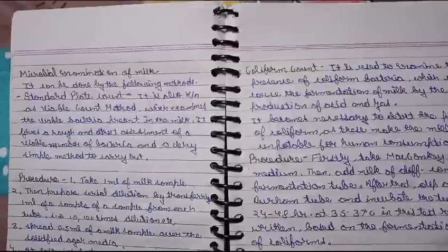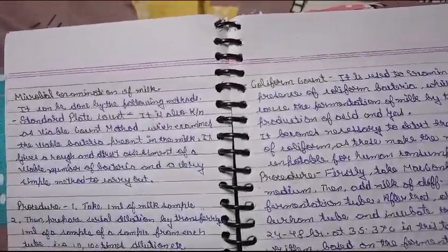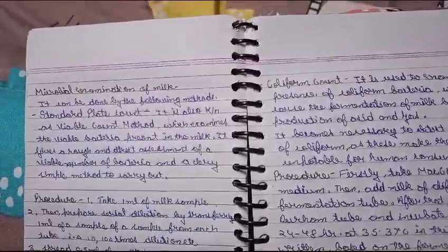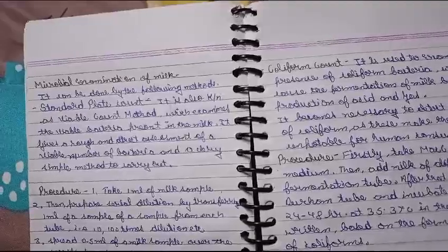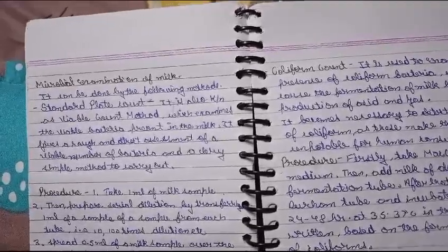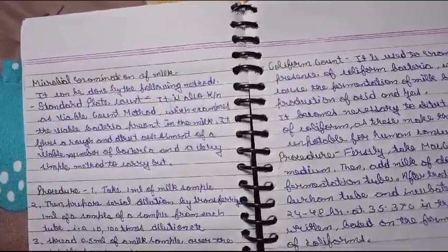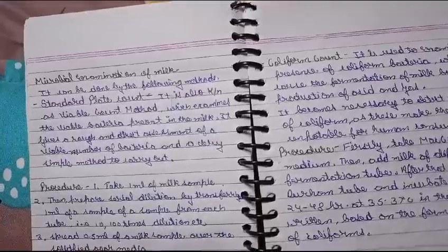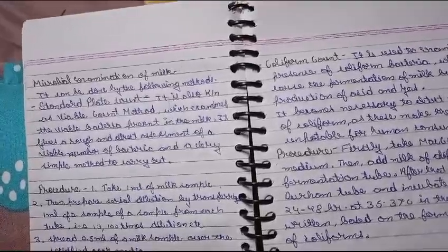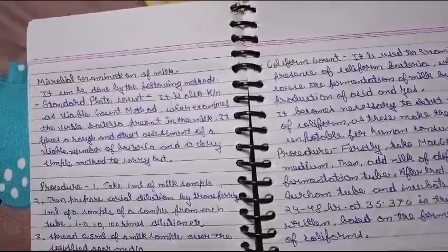Coliform count. Next, examination. It is used to examine the presence of coliform bacteria, which can cause the fermentation of milk by the production of acid and gas. It becomes necessary to detect the presence of coliforms, as these make the milk unpotable for human consumption.